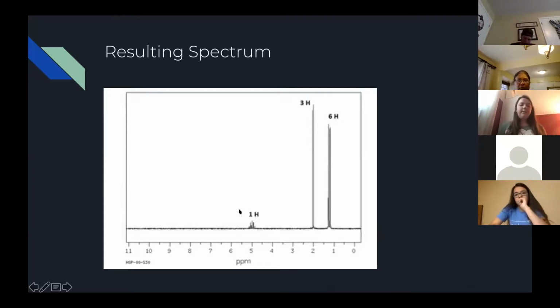So I would just sit there and be like, okay, I just got this chemical shift, integration, and multiplicity. I'm going to draw this one signal, and then leave a little blank and keep on adding more as you go. You don't have to do it all at once. So you can see that this matches up though.